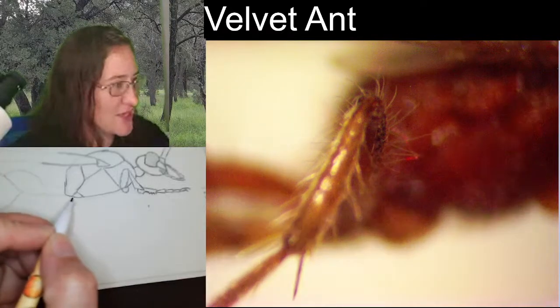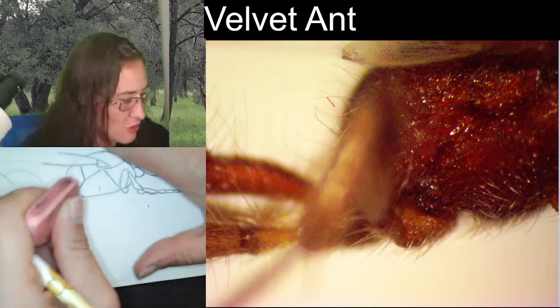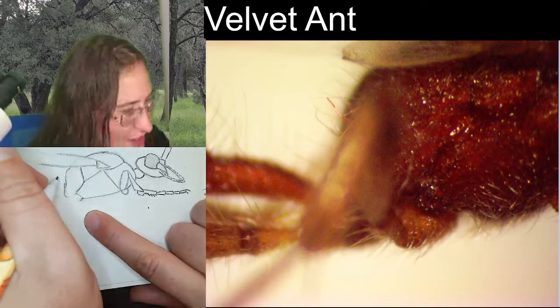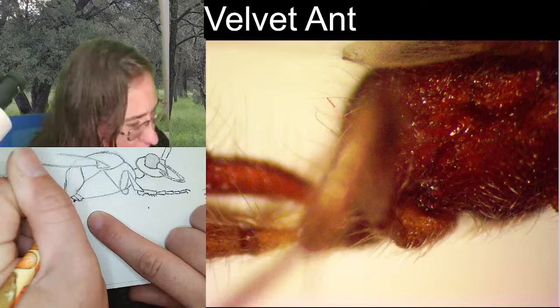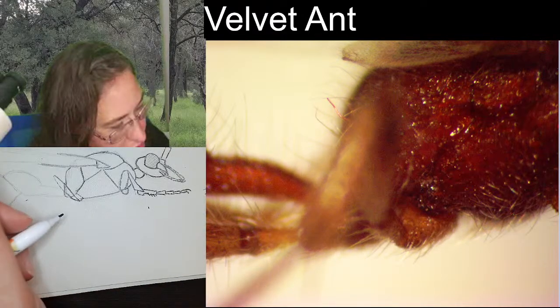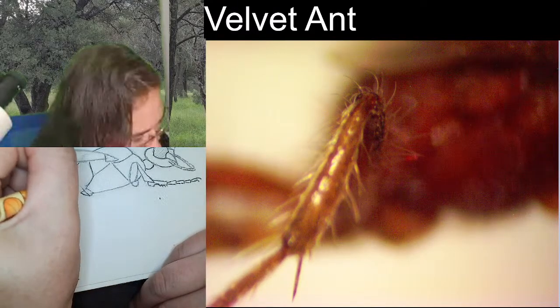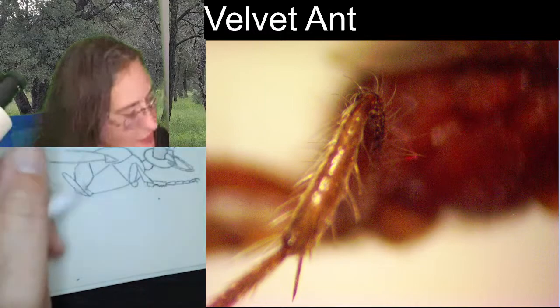So we have, and the coxa is bulbous a little bit past the body. So I'm going to change the bottom line here so that it's just a little bit more bulbous. And then I'm going to erase some of this too anyway, because I want to add this trochanter that is this triangular piece going up, and then the femur. See, the femur is so far kind of behind everything. And then the tibia is coming forward.